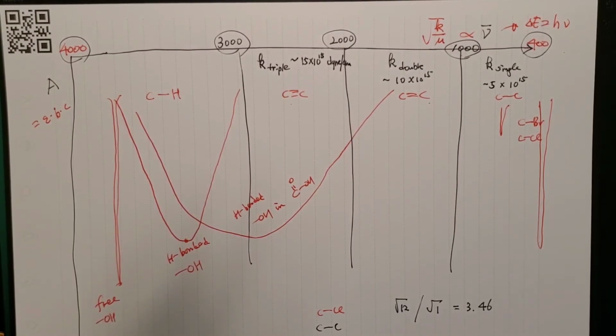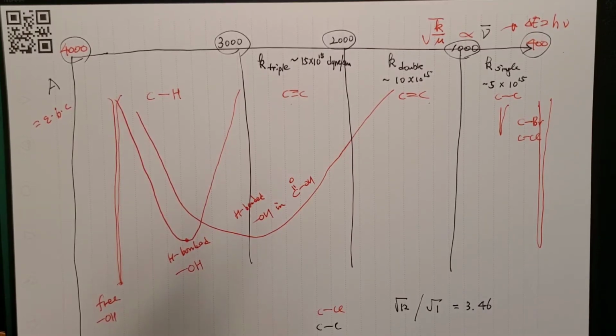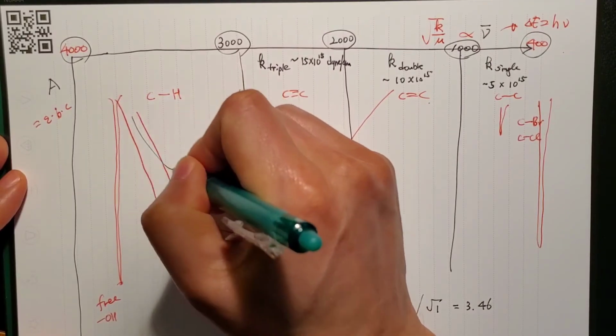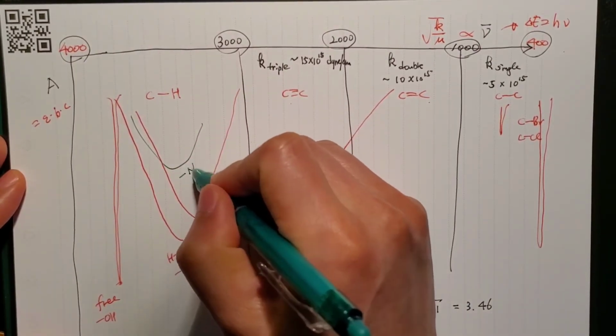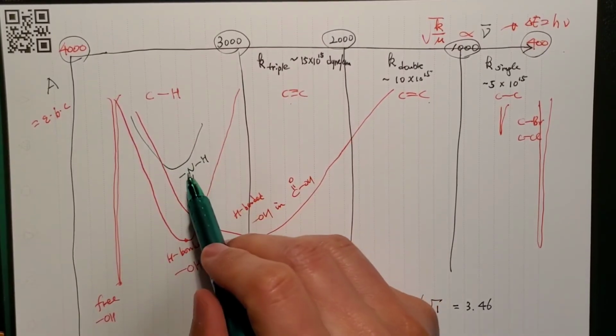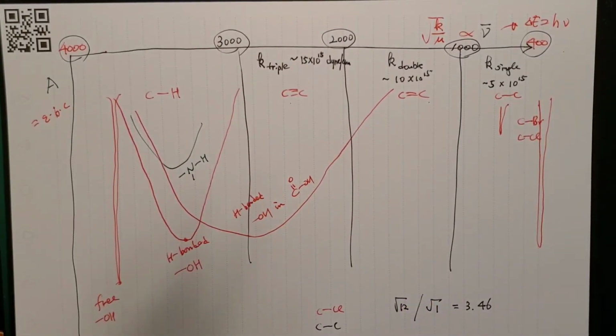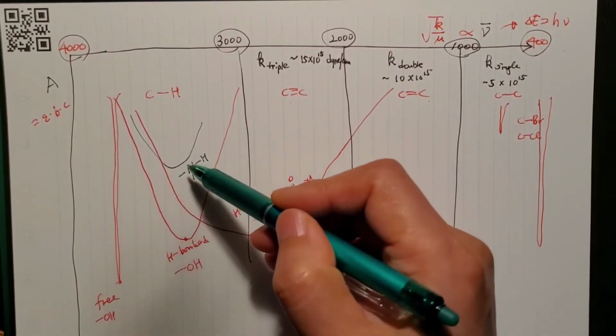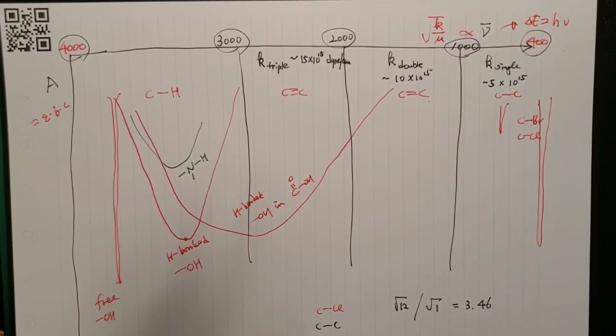Then what other atoms are found with hydrogen in organic compounds? You can see some of the polar ones other than OH will probably be amines, right? The NH, and NH could be the one in the secondary amine, real NH. That shows about 50% or even less, but it depends on the polarity.